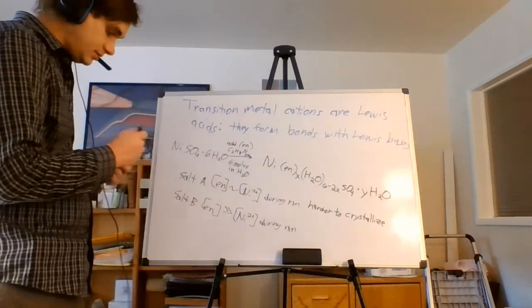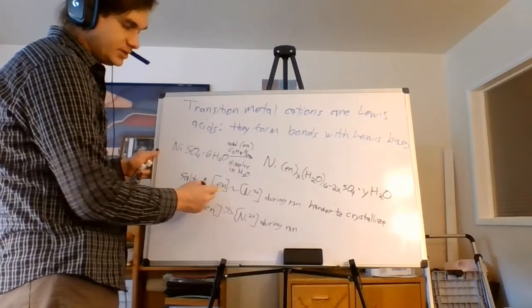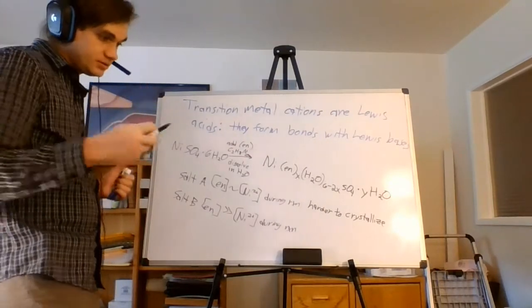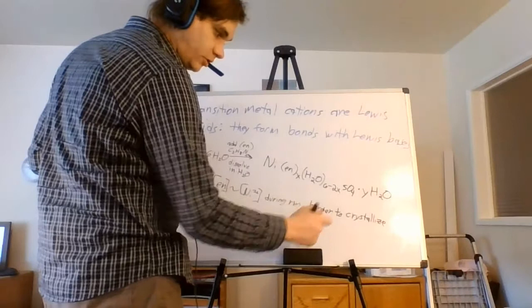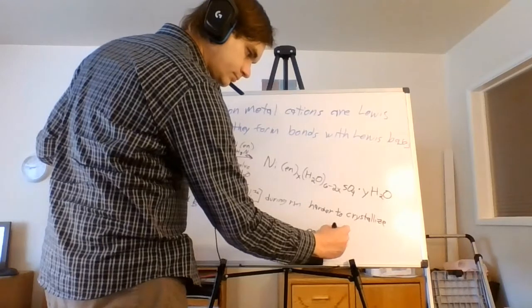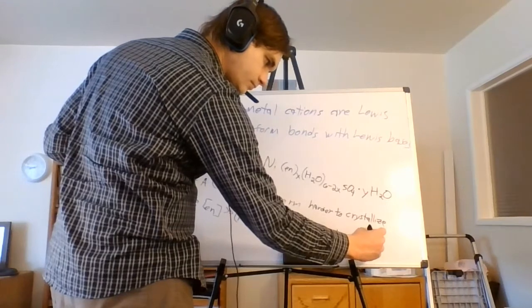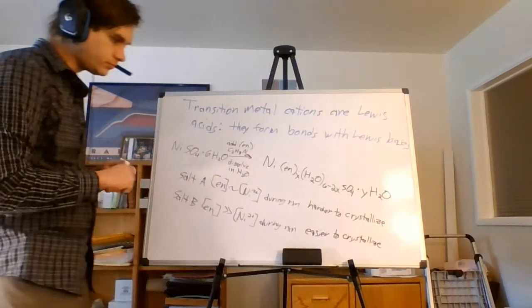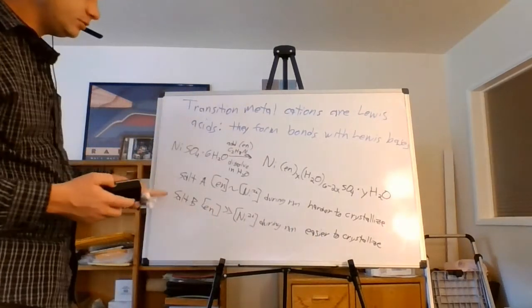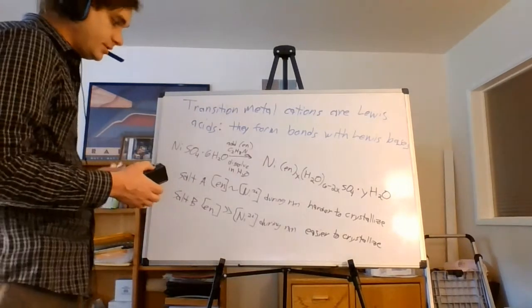Whereas the salt formed using method A has fewer ethylene diamines, and therefore it has water molecules pointing their hydrogens out. So it's much more soluble in water, and therefore harder to crystallize. Okay. So these are the two basic differences between the salts made using the different methods.